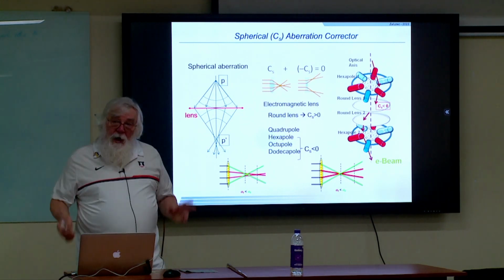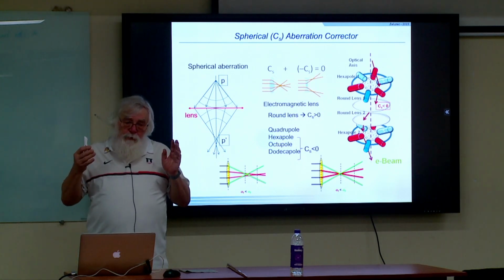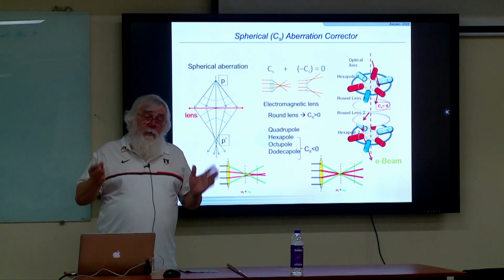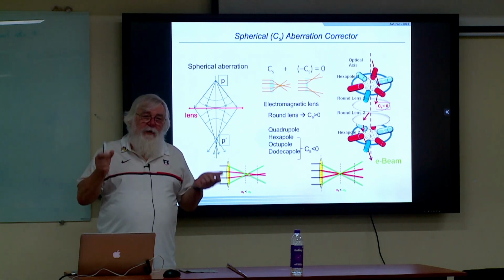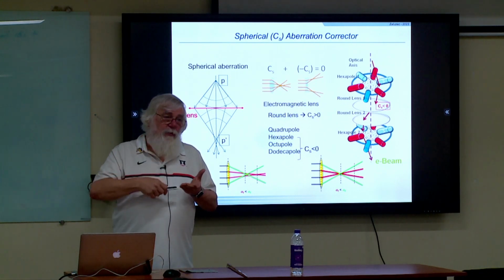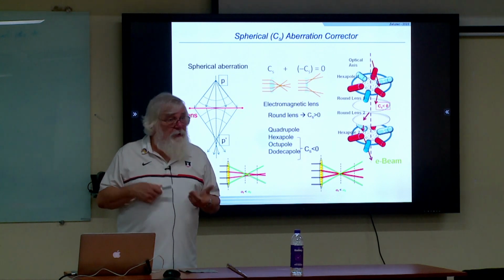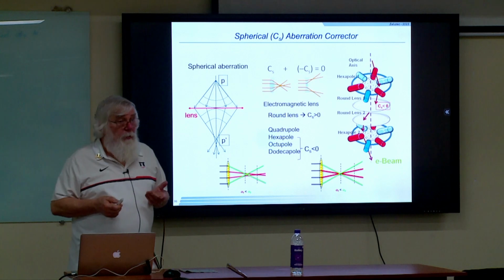With 100 lenses, it gets very complicated to align. One of the reasons that it took so many years to get aberration-corrected microscopes is that we couldn't physically, manually do all the corrections. Once we got the computer control, the computer processing power and the digital detectors, we were able to do all these corrections semi-automatically. They're never perfect. You still have to do some of it yourself, but it's speeded up the process enormously.